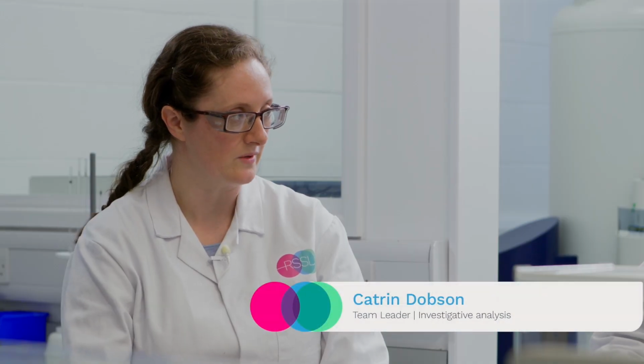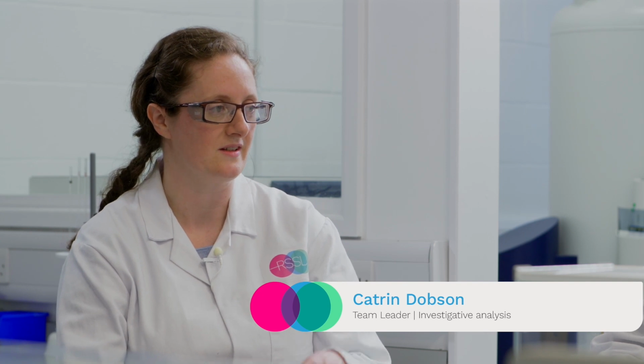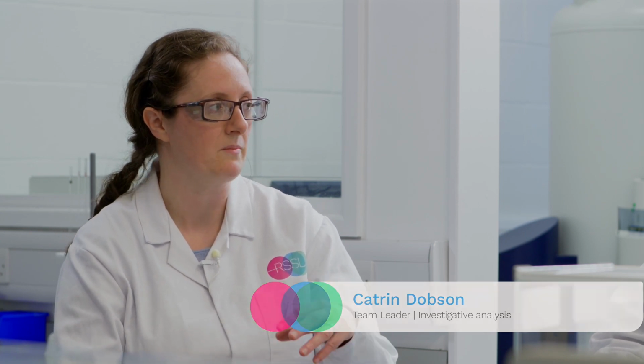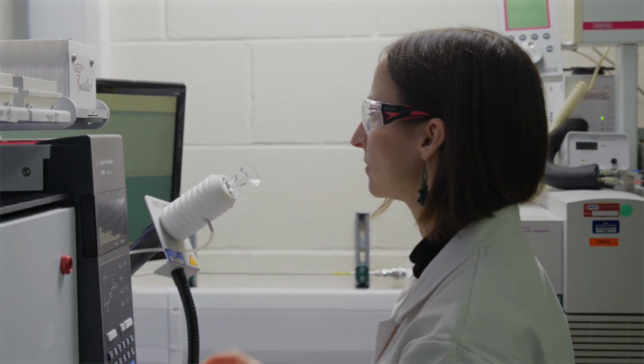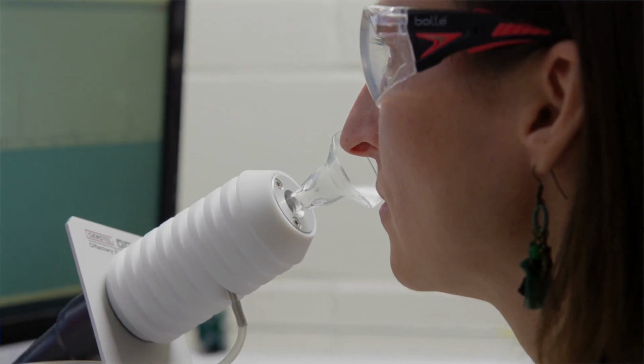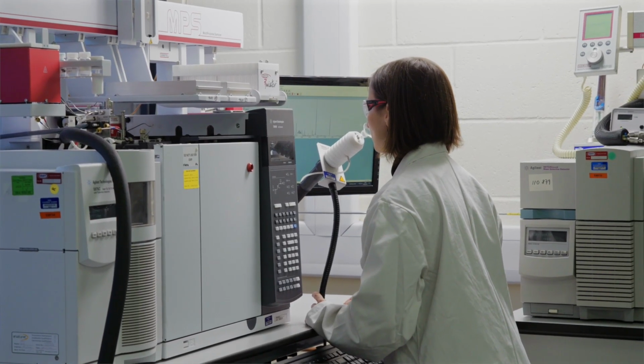So medicinal taints, that's in a confectionery product. How are we going to approach that? So I guess what we would start with is doing our own informal sensory evaluation, because to us that's key to understanding what might be causing the taint. We've got assessors that are specifically trained to look for certain tainting compounds, and when we hear the word medicinal we automatically think about halogenated phenols.